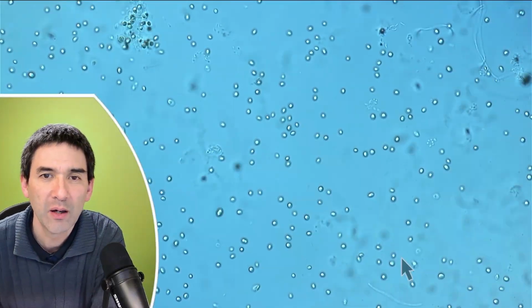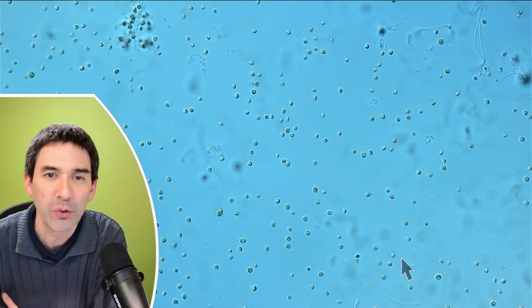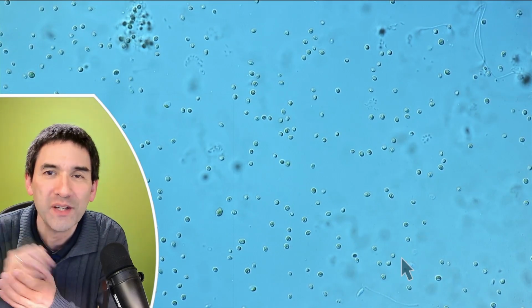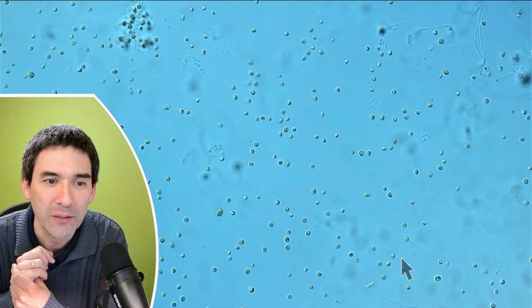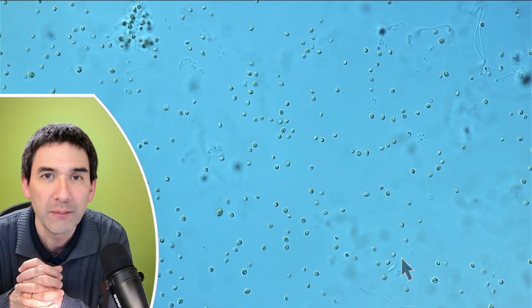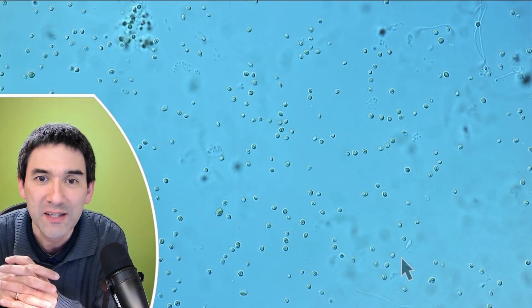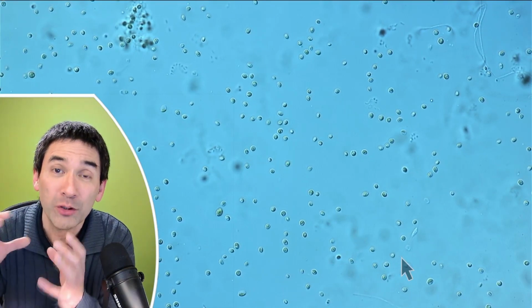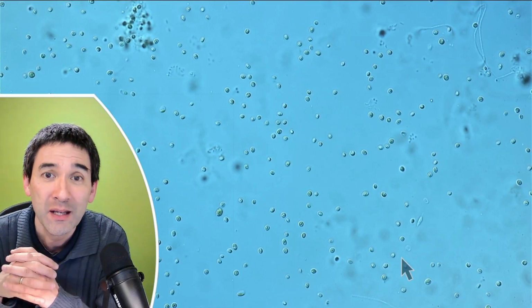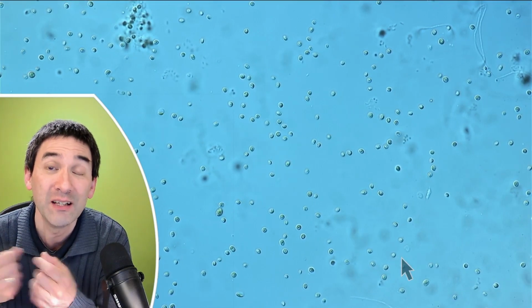Yeah, this is now at a high magnification. I'm using now a 60 times objective, and of course, the higher that you magnify, the more visible the Brownian motion, right? However, those cells are fairly large, and this means they have a lot of inertia, and this means they cannot move quite as easily. The larger the object, the more inertia it has, and the more stable it is. And for this reason, I think we have to look at some particles that are yet significantly smaller.